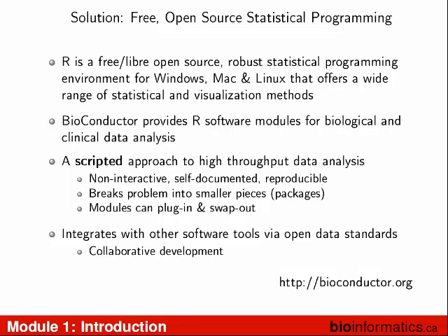And the way that it works, it's a scripted approach. So you have a little bit of mouse interaction when you're using something like RStudio, but you're going to get your fingers dirty on the keyboard. So as biologists, I get that. It's not the way that you're used to working with software. But the good news is, because it's all written down in a scripted kind of way, you can actually see the process that you have to walk through to do the analysis.